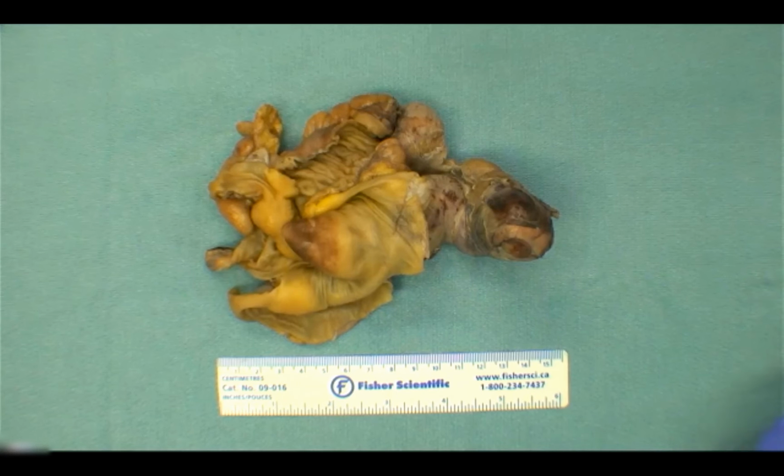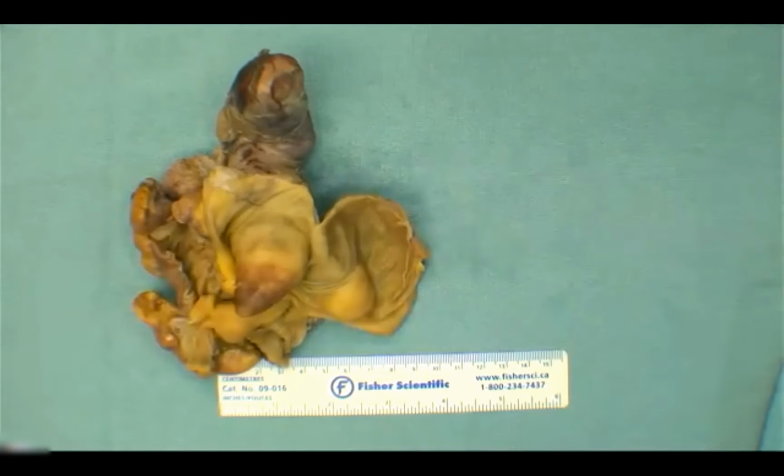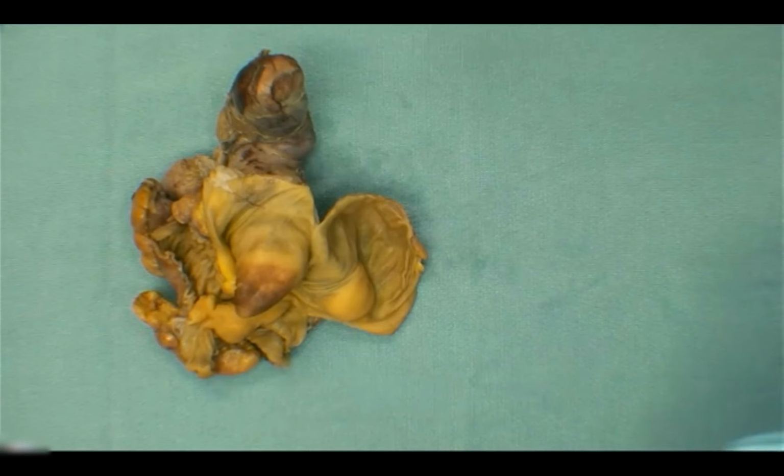And so for scale, I'm going to show you what that might look like. Okay. So keep in mind this image. And then we are fortunate enough, just like I imagine a lot of Surg Path labs would have, a good old-fashioned classic traditional appendectomy specimen. Yeah.